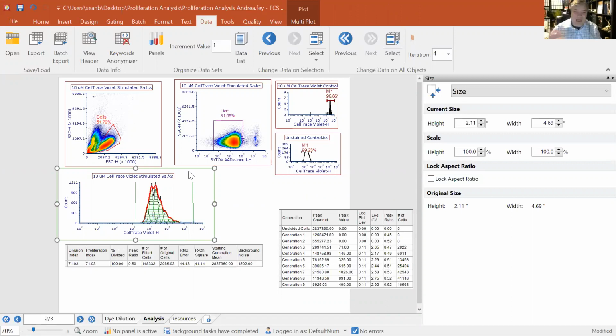But as you optimize these assays and run them over and over again, you'll get a better feeling for the way it works. If you have really perfect data and your assay is super well optimized, you can get away with fewer events, right? But if you have big spreads in your data, big CVs, you're going to need more events to offset that kind of error.